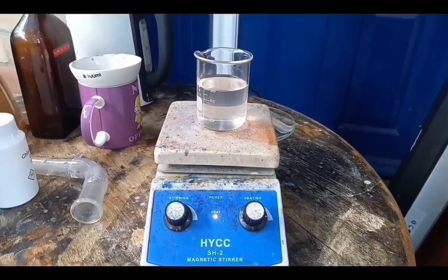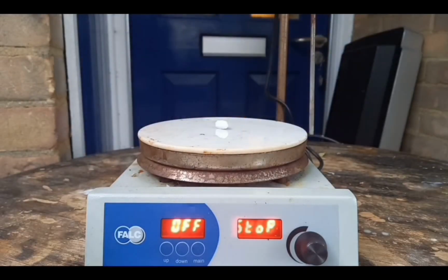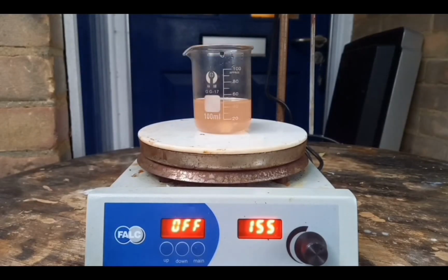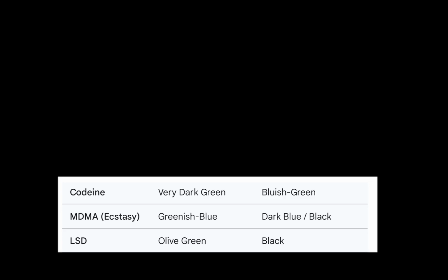To oxidize our solution of selenous acid, we're going to need something powerful. I'm going to use bromine for this. That pink color you can see is almost unavoidable. That is elemental selenium that has been reduced by something.